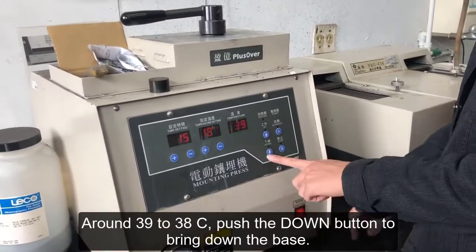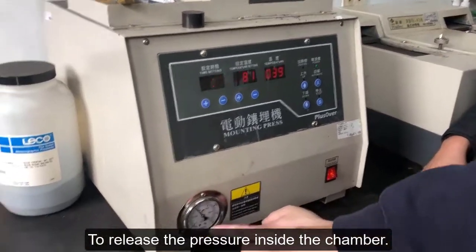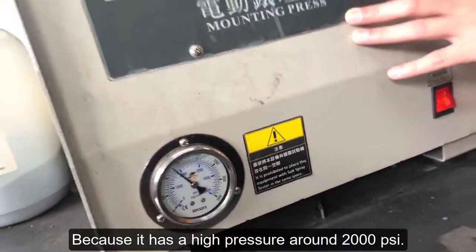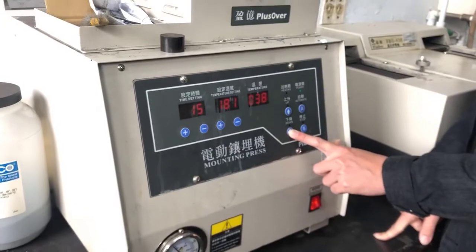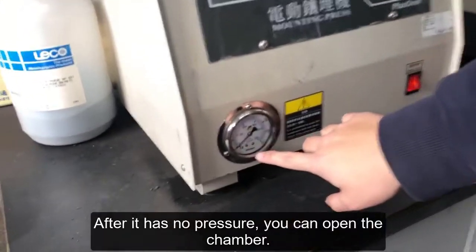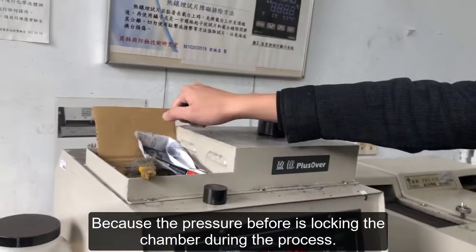The temperature cools down after the process finishes. Around 39 to 38 degrees Celsius, push the down button to bring down the base to release the pressure inside the chamber, because it has a high pressure of around 2000 psi. After it has no pressure, you can open the chamber, because the pressure before was locking the chamber during the process.